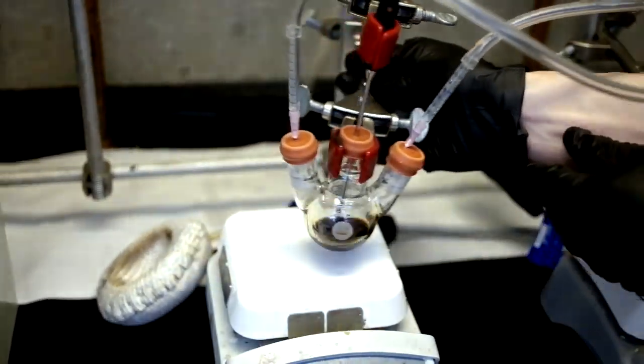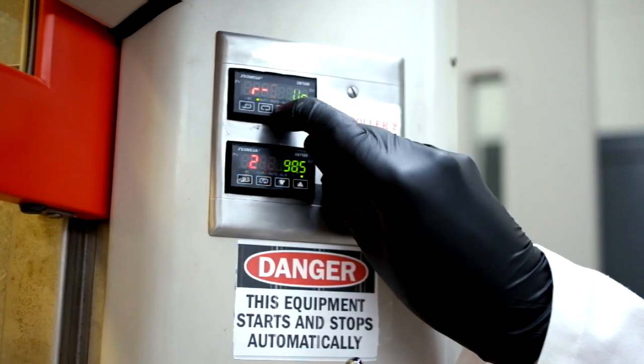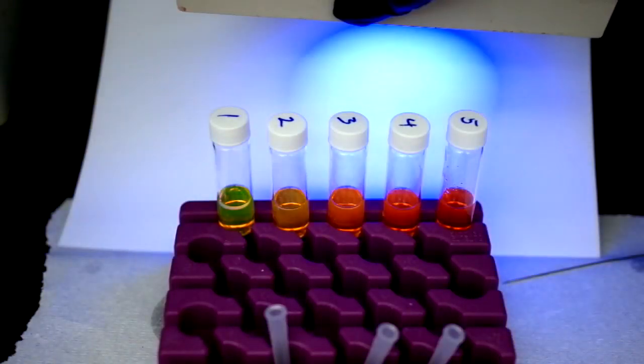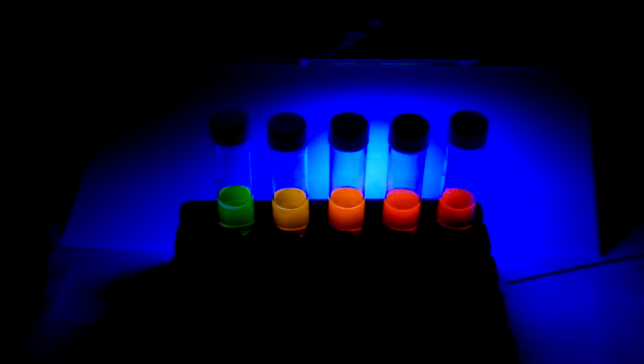After 5 minutes, remove the flask from the heat mantle and shut off the heat. You will notice that the fluorescence of the samples change from green to red.